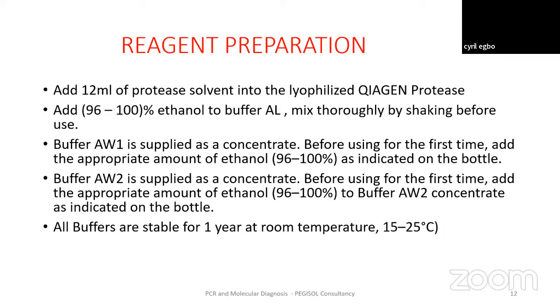Most reagents come in lyophilized form, and they have a diluent which you reconstitute to have your working reagent.